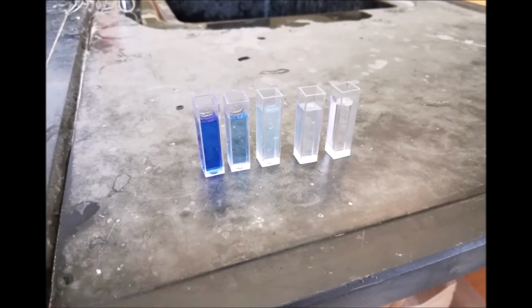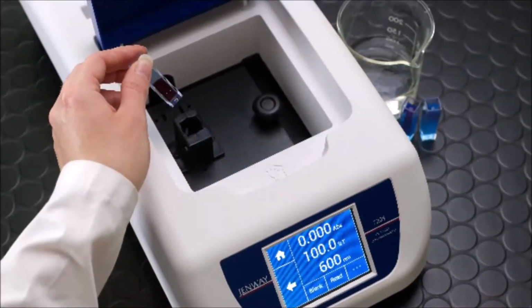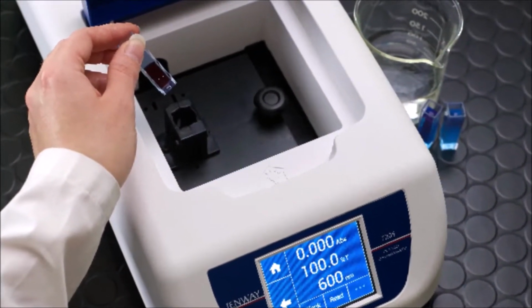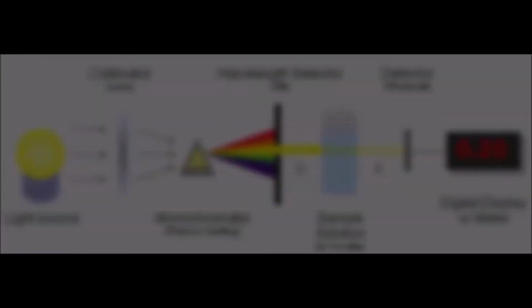In today's video, we will demonstrate how to properly utilize the spectrophotometer. In doing so, we will obtain absorbance values at a specified wavelength for the dilutions made. With those values, we can use the relationship between concentration and absorbance to find the concentration of an unknown dilution.